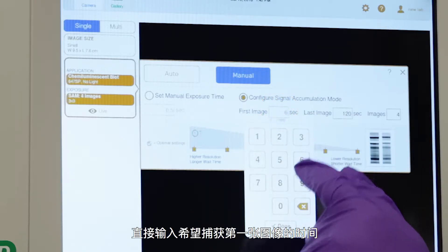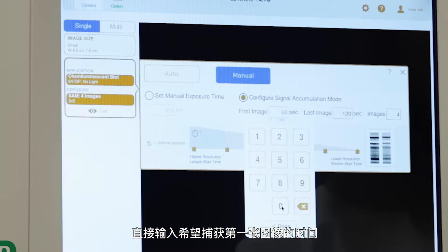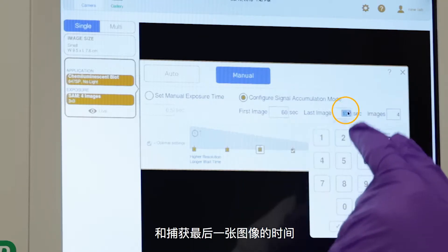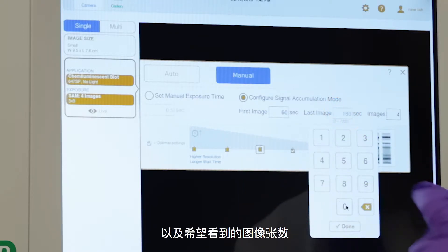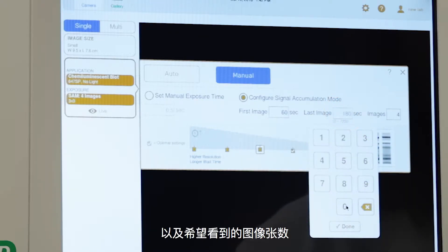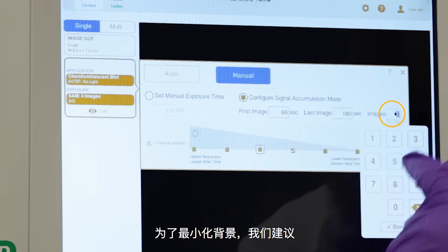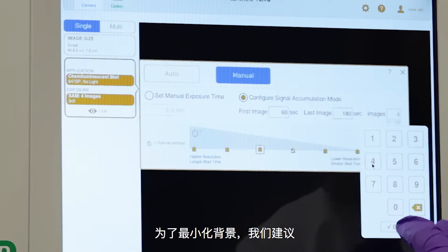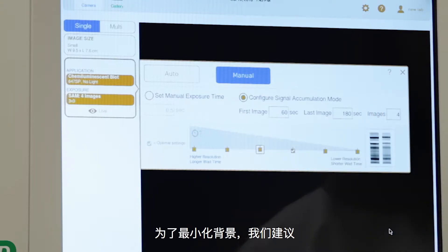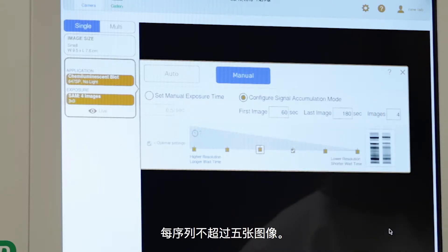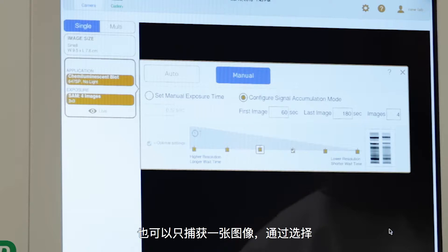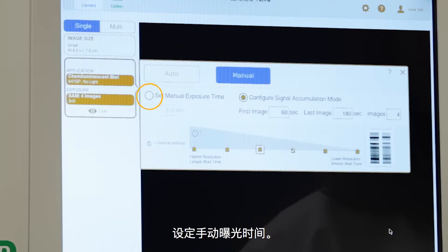Simply enter the time you want your first image captured, the time you want your last image captured, and the number of images you wish to view. For minimal background, we recommend fewer than 5 images per sequence. Or you can simply capture a single image by selecting Set Manual Exposure Time.